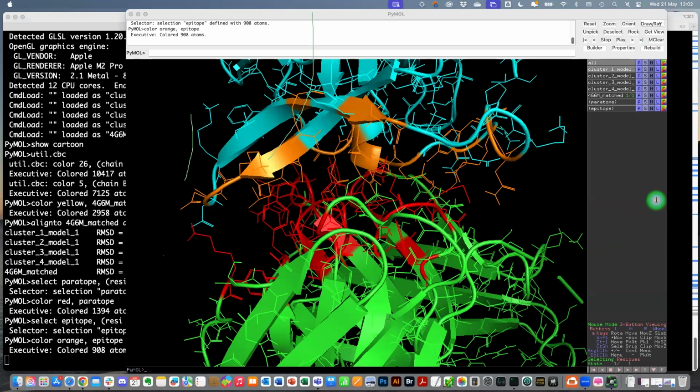Yes. So this is for any type of proteins, it will work in principle, yes. If you mean the one where we're processing the PDB files, yes, you can do it for any type, but of course you have to check what the chains are in your file. Because here we are processing an antibody, and for antibodies, the convention in a PDB is that it's H and L. So before processing a file, you should go to the PDB and look at what is in that file actually.